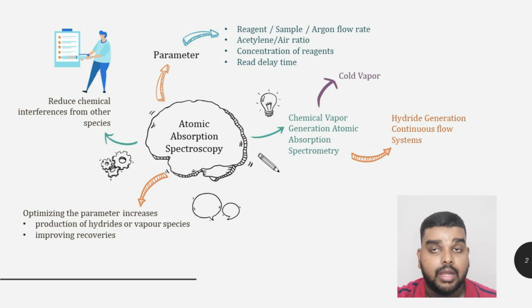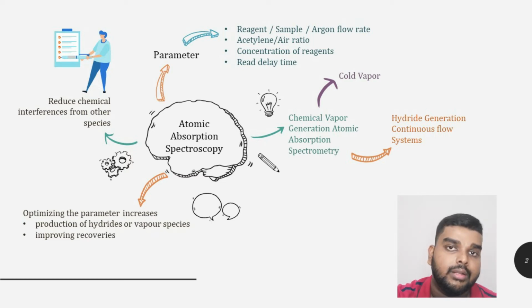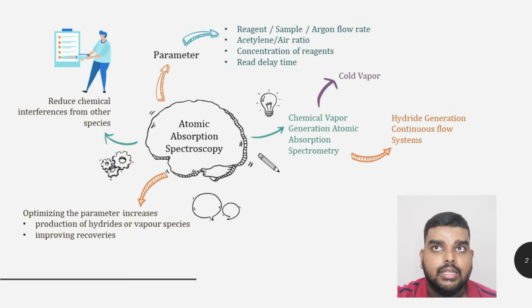So let's talk about the parameters. There are many types of parameters. First is the reagent, sample, or argon flow rate. Next is the acetylene-air ratio, concentration of the reagent, and the read delay time.